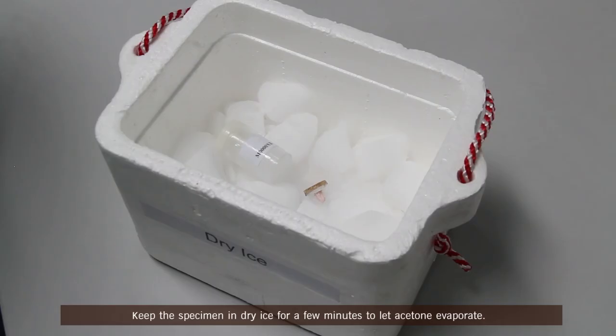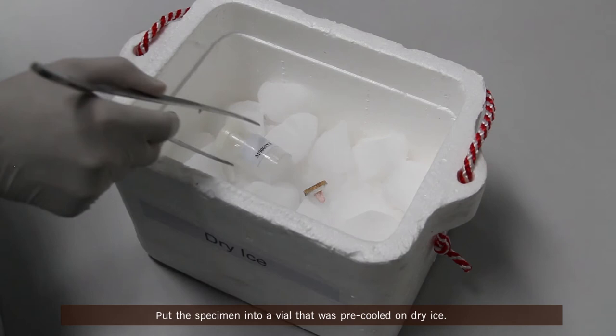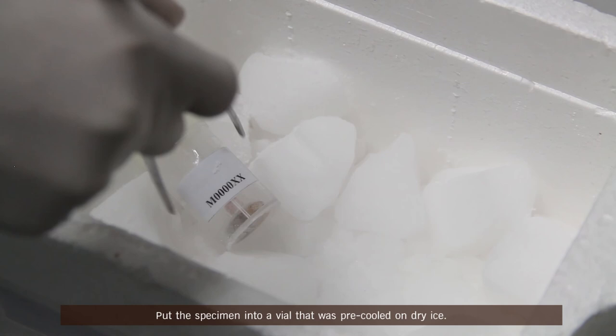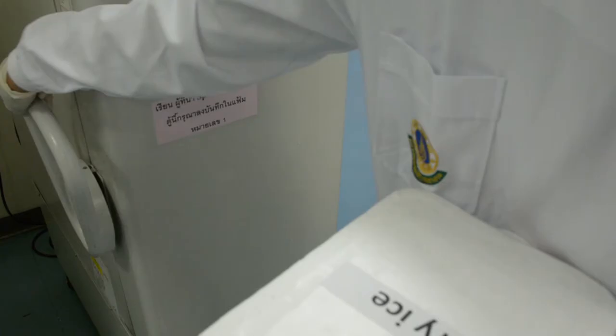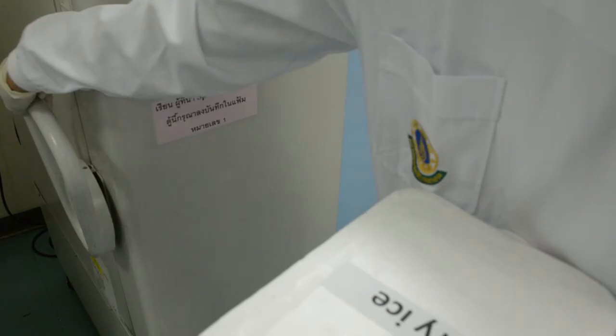Put the specimen into a vial that was pre-cooled on dry ice. Keep the specimen in deep freezer at minus 80 degrees Celsius or transfer to a referral laboratory with dry ice.